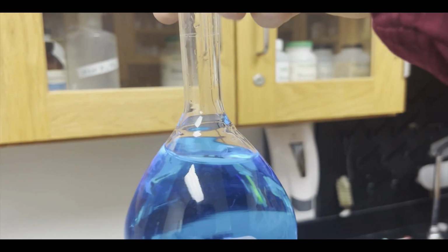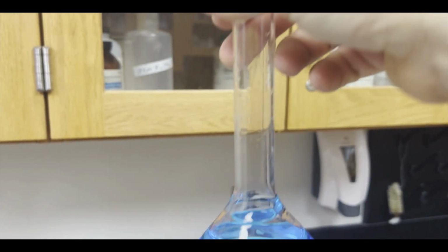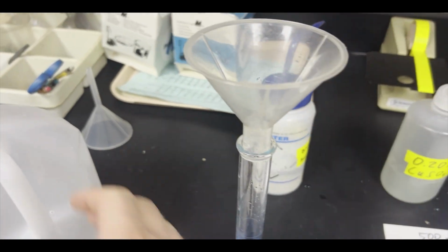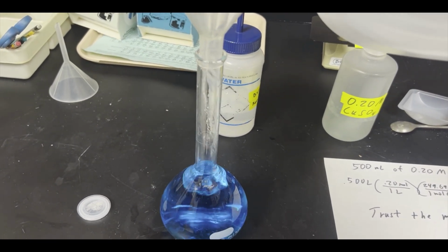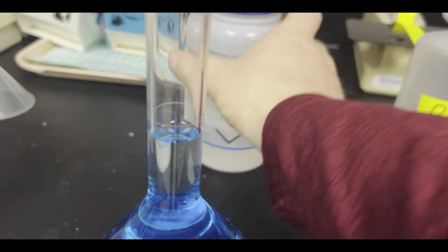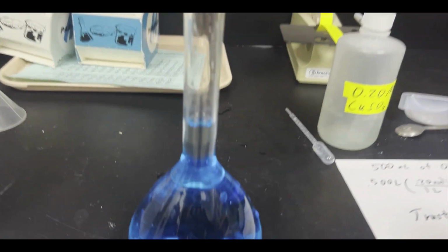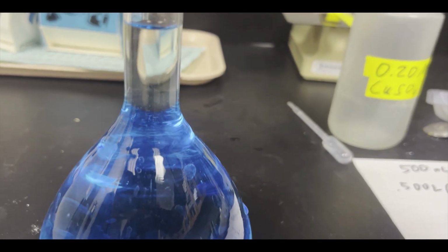Now, last step as well, I have most of the water in, but I need to fill it up to that line right here that my pinky finger is kind of showing. So we're going to set that down, and I'm going to start with my funnel. I'm going to pour a little bit of distilled water in. I'm going to pour until I get close. And then when I get close, the last step is to use a squirt bottle, something that is much more precise, and then just squirt water in until you get to that line exactly.